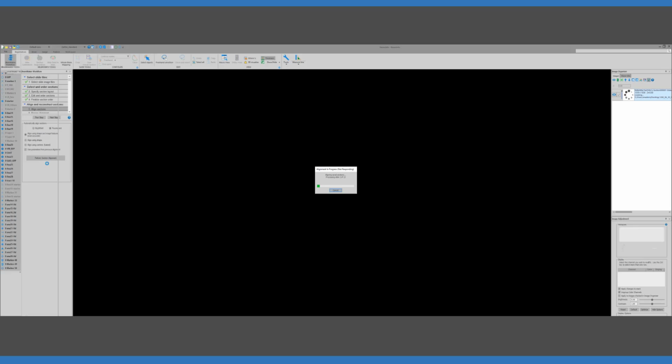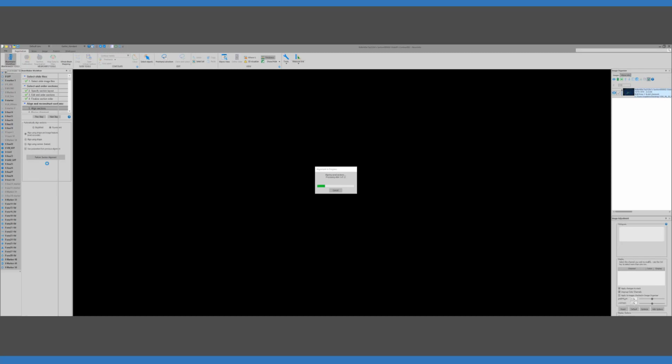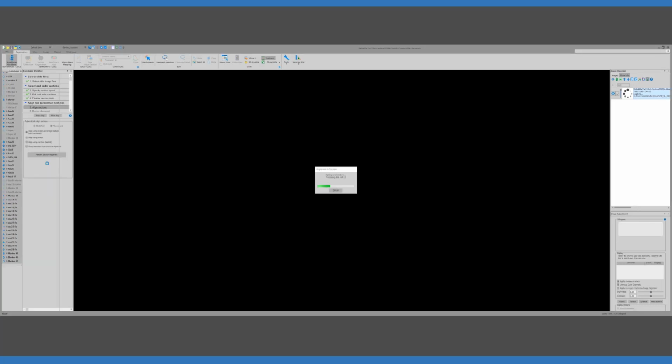And there are 3 options that are available here for how to do the alignment. They basically do a trade-off between accuracy in the result and how fast it operates. The one that Chip selected is using image features to do the alignment. What this does is it uses all of the available image information to align each section. And it works really well when the intersection spacing is reasonably small between the sections. Then the result is that the neighboring sections appear fairly similar, even though the appearance of those sections changes gradually as you move through the brain.